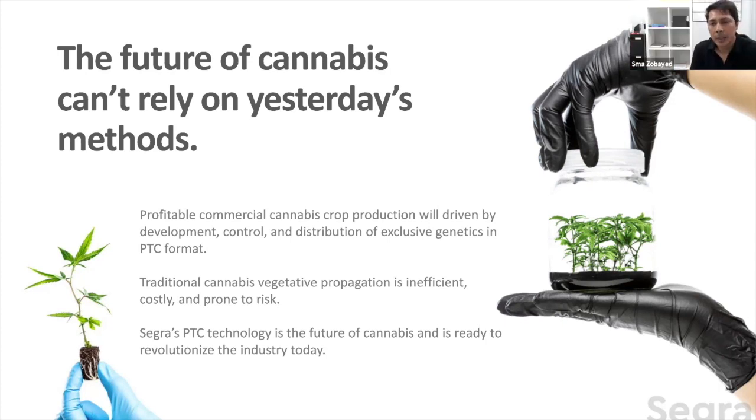Meristems are dome shaped. If you think about a cabbage, you take the covering leaves off, and eventually you get a small dome-shaped structure. That's the meristem. I'm just giving an example. In this case, cannabis doesn't have that many layers of leaves, so after a few leaves at the very top, it's easy using a stereo microscope to uncover them, and you can see a very small dome shape.